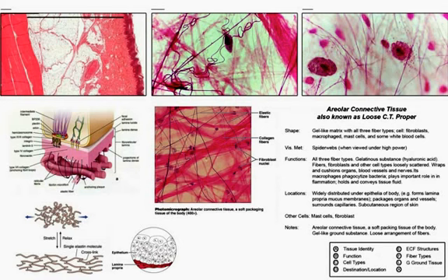There's a number of different cells in each of these slides. The most numerous type of cell would be, of course, the fibroblasts, the smaller conical shaped cells here, and fibrocytes that are the mature version of that, laying down the matrix of hyaluronic acid and water throughout, the ground substance that would be added to hold together the fiber types, the collagen fiber, the elastic fiber types, and then the reticular fibers that are present in this particular slide.